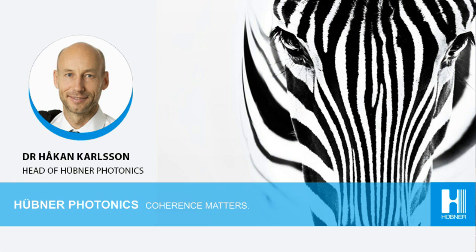The diode pumped lasers are less sensitive to this. For this reason, we often recommend that the diode-based lasers are used together with an optical isolator, which can be integrated in the package of the lasers, usually from our platforms. And these isolators that we offer provide a dampening of the feedback of about 20 dB.